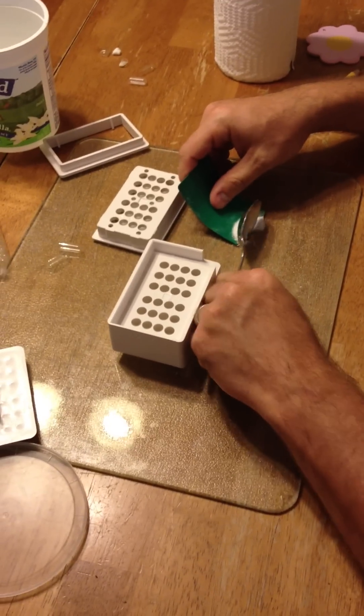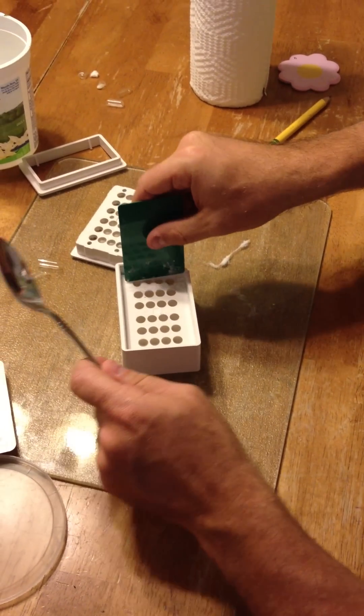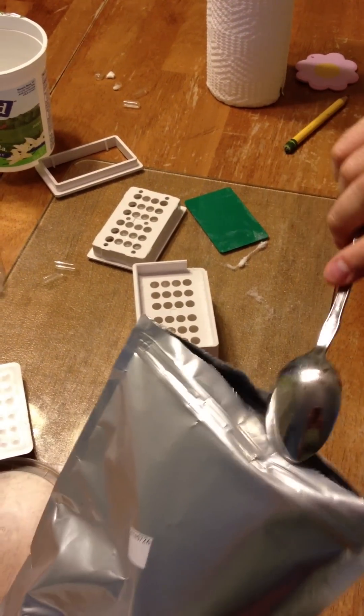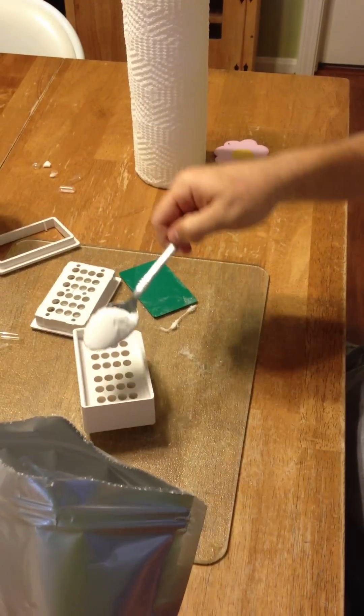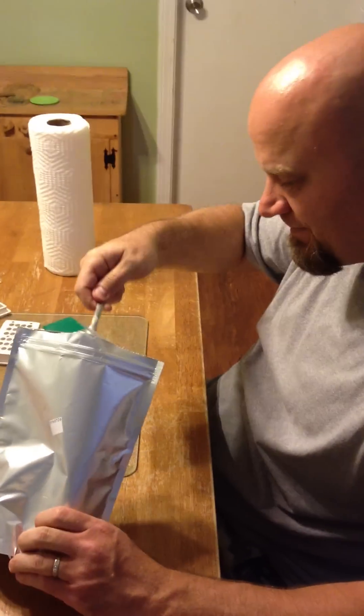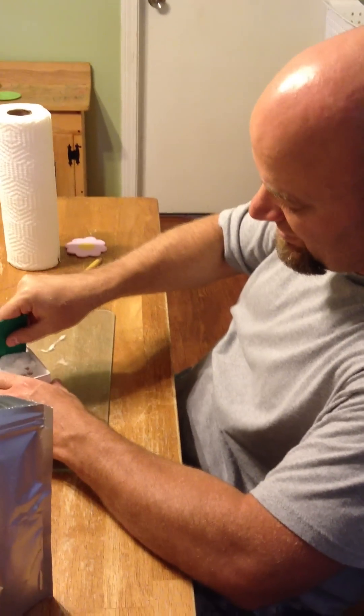I recommend a glass counter because it is really smooth and easy. It looks like drugs but trust me it is not — it is just Piracetam. What you do is you take this and put it in there, but that is obviously not enough, so you get some more Piracetam and spread it over like that. Then you spread it over the top.